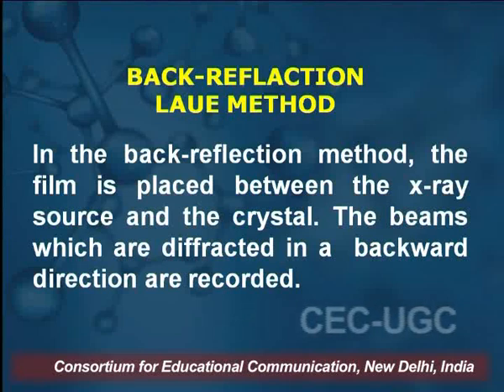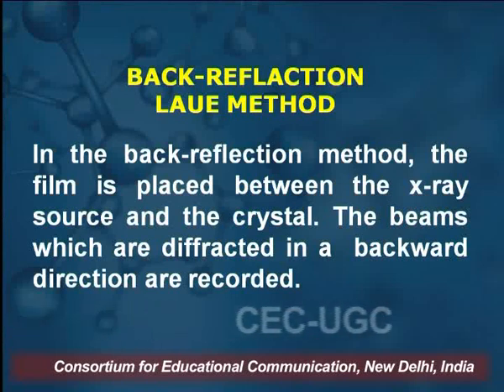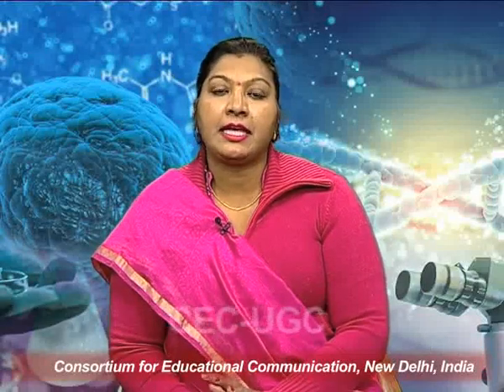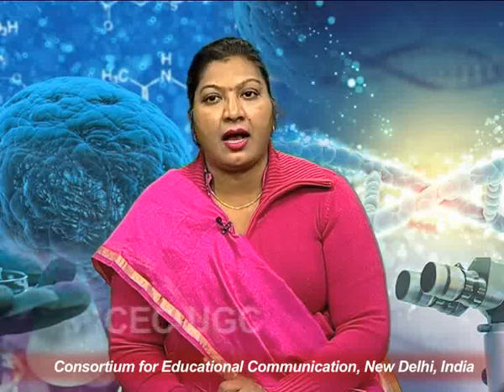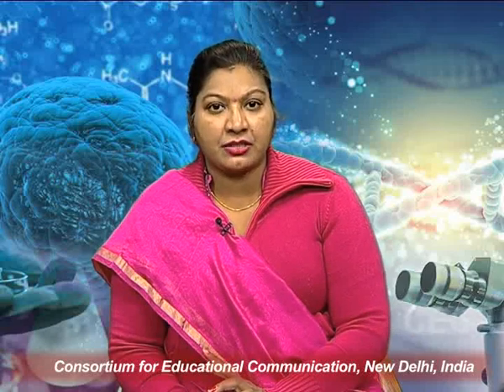It means we can get the back reflection through the beams which are diffracted in the backward direction, and the pattern is recorded. So in the back reflection method, the film is placed between the X-ray source and the crystal. The beams which are diffracted in the backward direction are recorded. So it is called the back reflection Laue method.